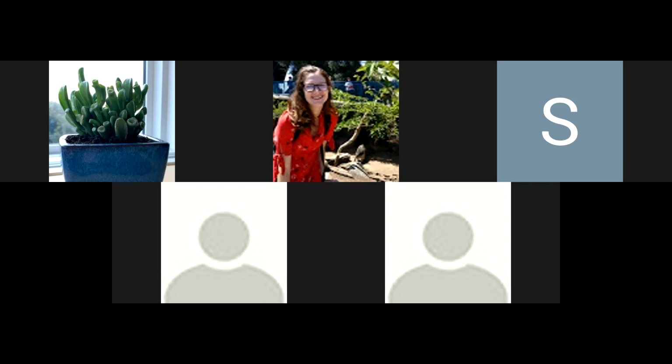But again, what do you think, Sam? I just like multiple perspectives. So I would do the same thing three times, using the feature plots, the heat maps, and the dot plot. That's what I would do, but that probably would not make its way to the publication. You look at all of them and then use that information to call the cell type.